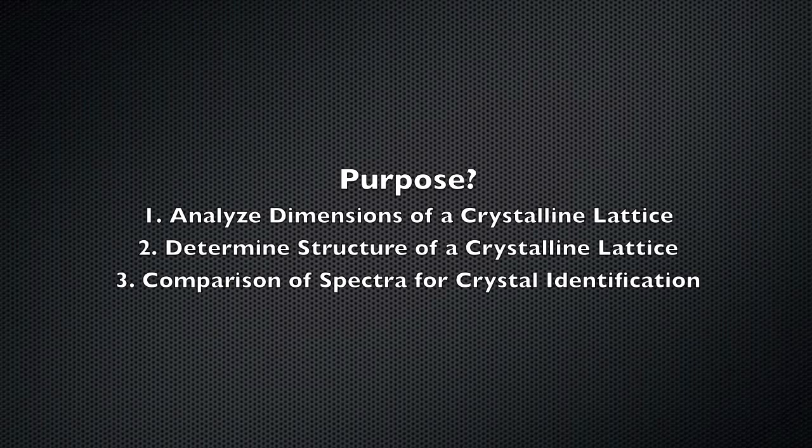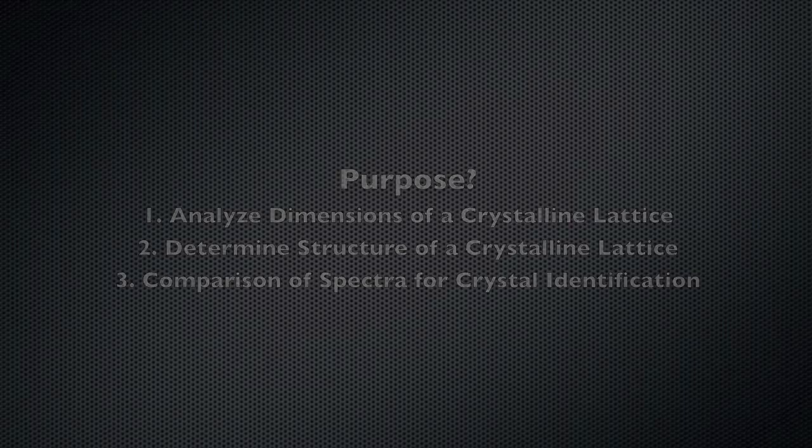Step 2 involves determining the structure of the crystalline lattice from the information that was gathered in step 1. In the third step, comparison of spectra is used for crystal identification. Previously stored crystal spectra are used to indicate if the crystal is a new discovery or is already banked in the library.